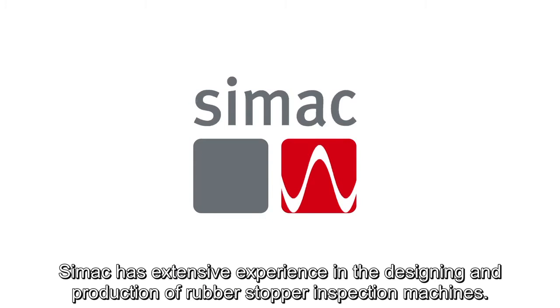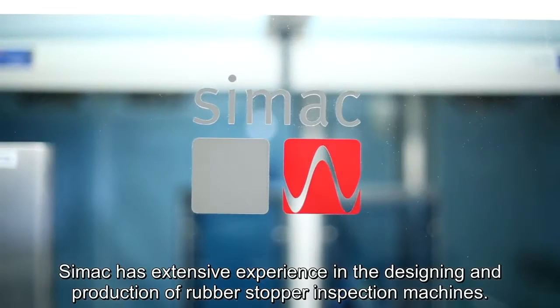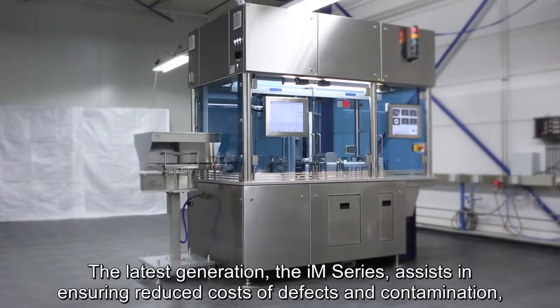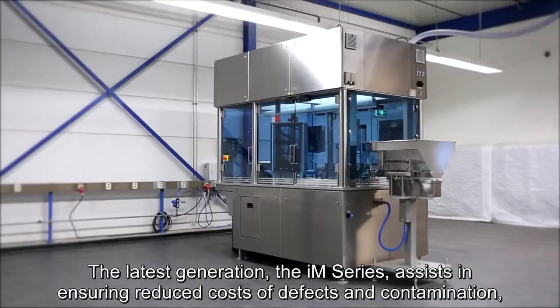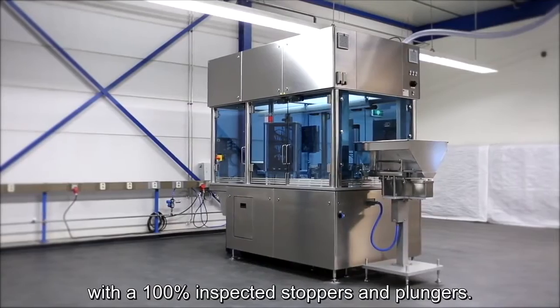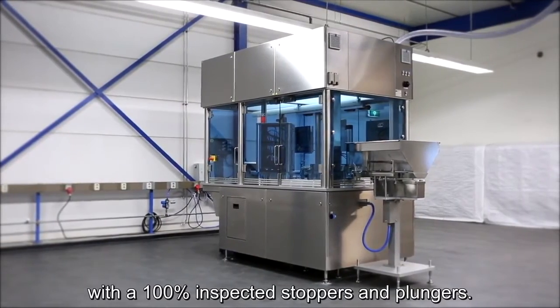CIMEC has extensive experience in the designing and production of rubber stopper inspection machines. The latest generation, the IM series, assists in ensuring reduced costs of defects and contamination with 100% inspected stoppers and plungers.